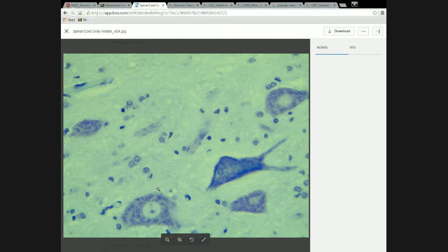Sure, you're all being silent because you're like, oh, it couldn't be that simple and obvious of an answer. But it is. Ribosomes make proteins. These cells stain darkly for ribosomes. So these cells do what? Make protein. Right.